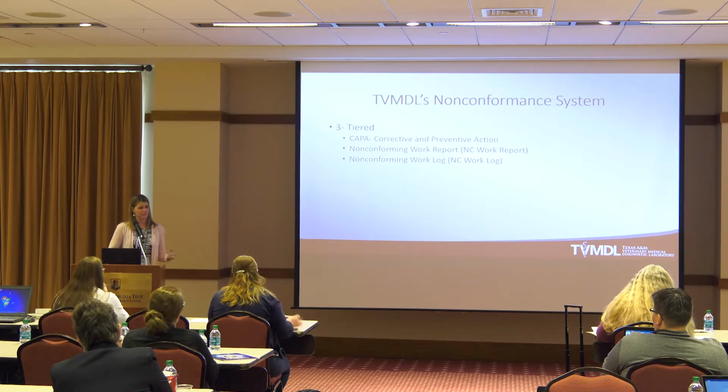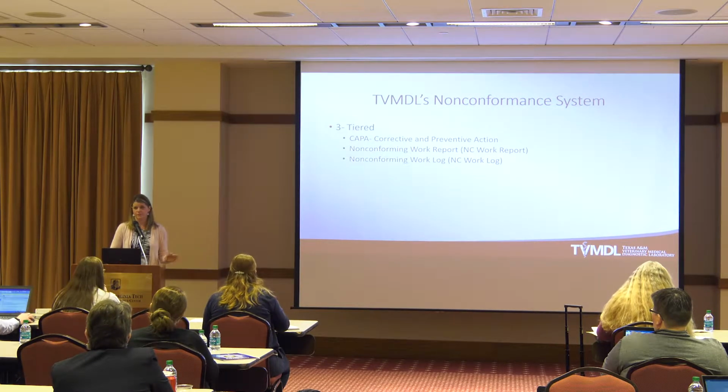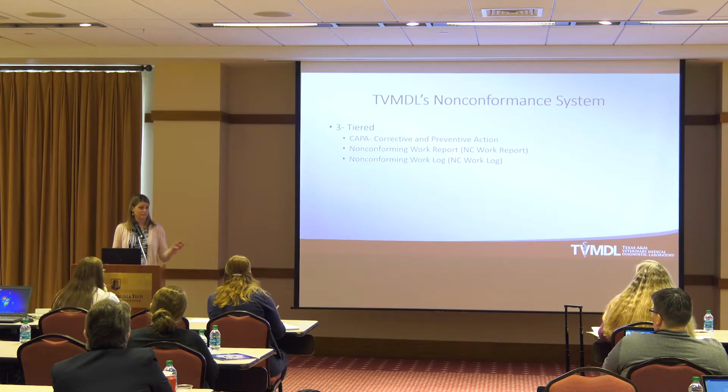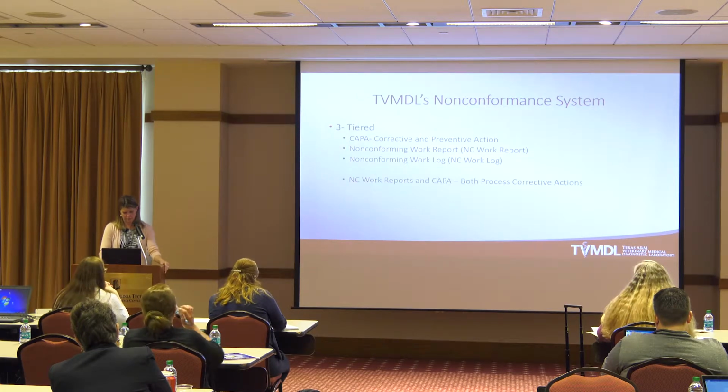So it's a record of maybe they caught that a number was transposed in a particular case. They can make that change and then they want to document it, because QA still gets those logs and we can look for trends. So if we see that this is happening frequently, then we may need to go back and say, why are y'all always transposing numbers on your slides? So it's not considered a corrective action. It's something we caught, but we do want to keep a record of it and evaluate trends.